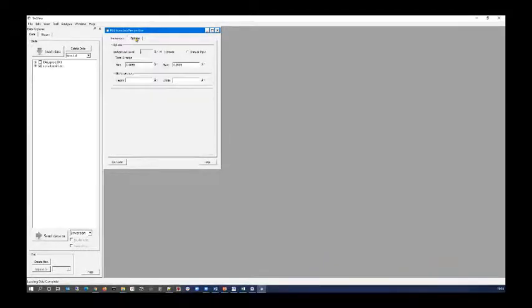In options, again, we can vary the range we want to do things over, and we can either manually set a background level or we can let the program estimate it. There is a little bug at the moment in that when it estimates, it's not showing the background level. We are aware of that one.